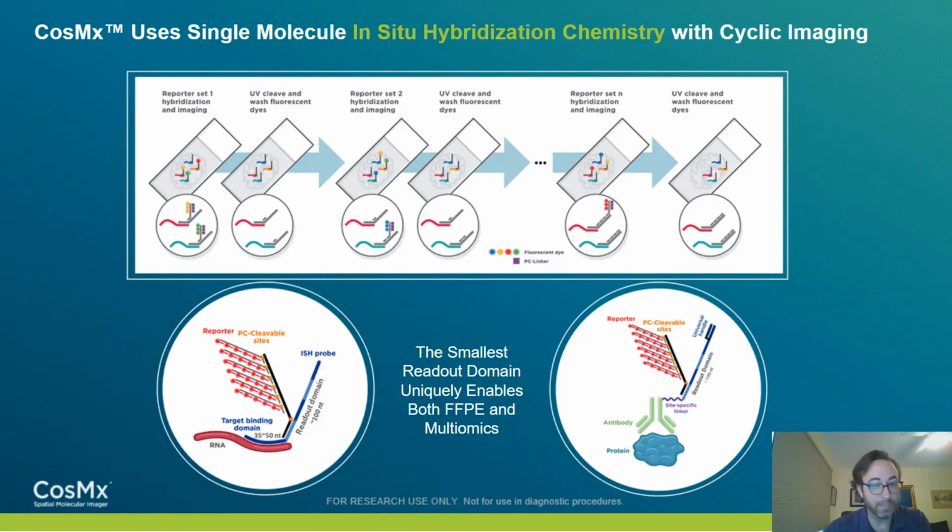The magic really happens, again, by the fact that we're using those probes, those particular affinity reagents, with barcoded sequences that we can read out. But instead of collecting the sequences, like we do with GeoMx, what we're doing is going to directly image them within the tissue. And to get the imaging to work right, we have to do a few tricks.